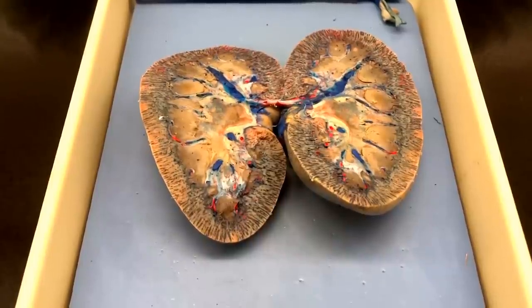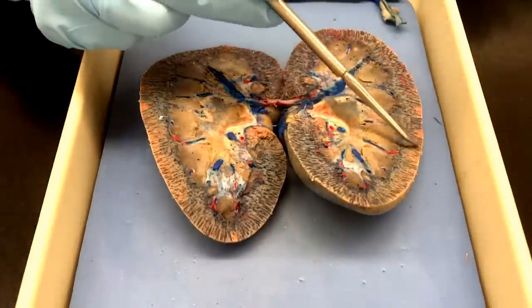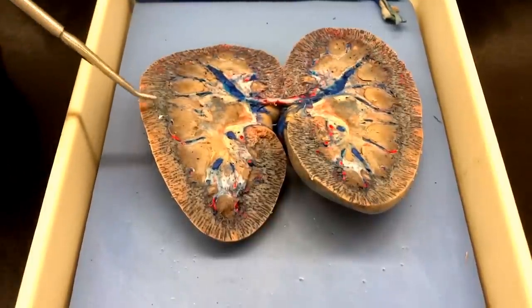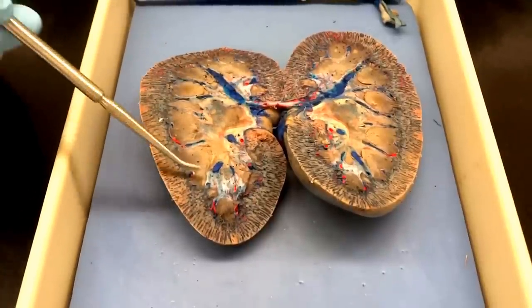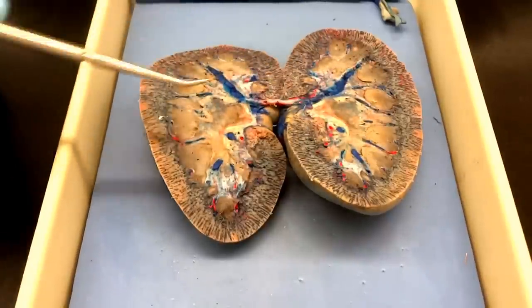So you can see the differentiation pretty well there of where blood is versus where urine is. If you look along the outside layer, which is our renal cortex, that's where the nephrons are going to be starting. All the blood is heading out there, they're gonna be filtering the blood and bringing it down through the channels into the renal medulla. I've also heard that pronounced medulla. I like medulla better. Me too. Medulla is fun to say.